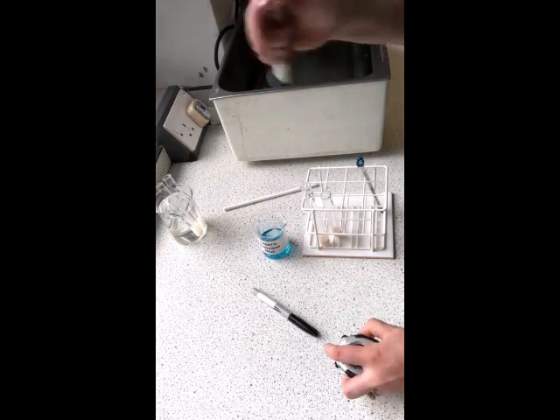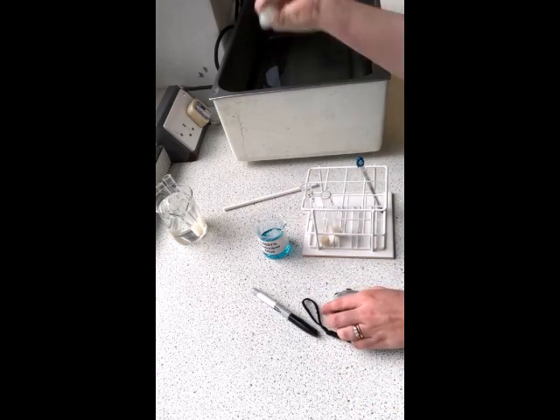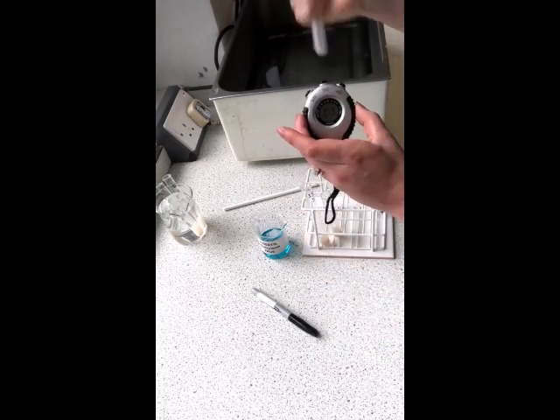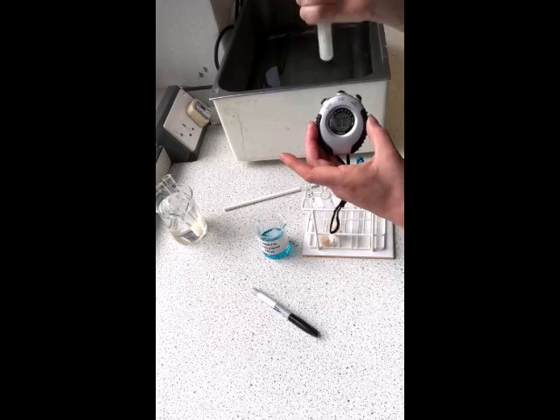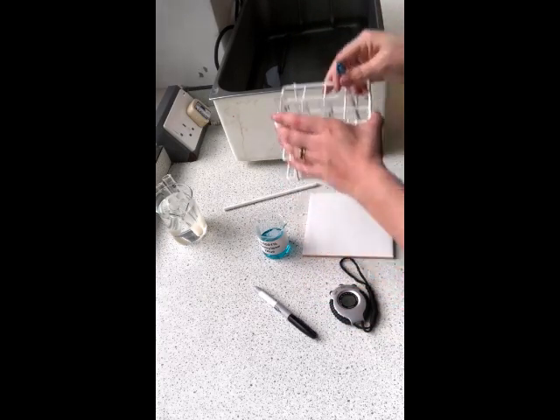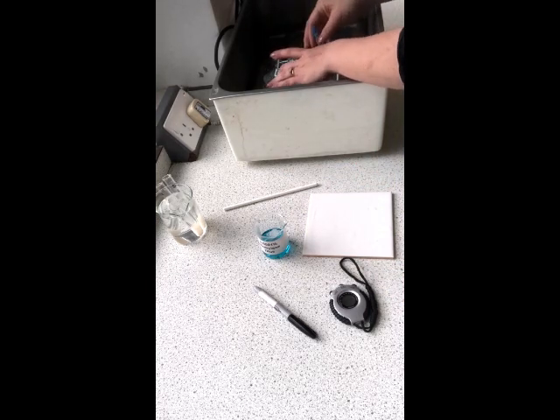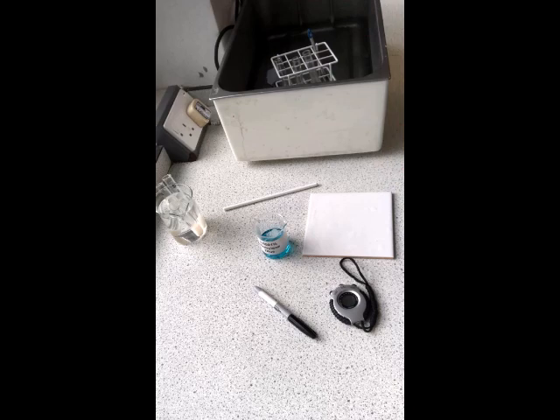Give it a shake and start our timer. Okay, and then we'll pop it all back in the water bath and keep an eye on it becoming colourless. So position it so that you can see, hopefully as well as possible, and don't shake it anymore.